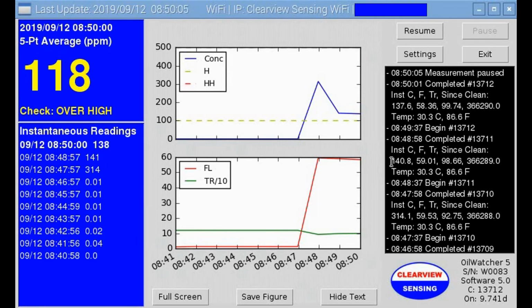Here are the readings with concentration, fluorescence intensity, and transmitted light intensity. It's important to determine how close the readings are by seeing a change in fluorescence of less than 1 intensity and a change of transmitted light of less than 2 intensity. We can now grab a sample.